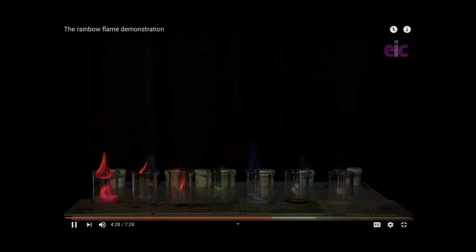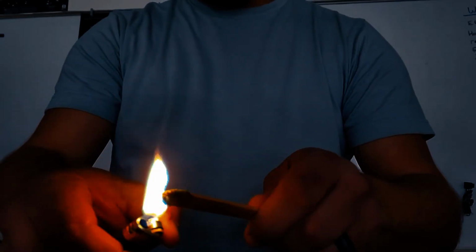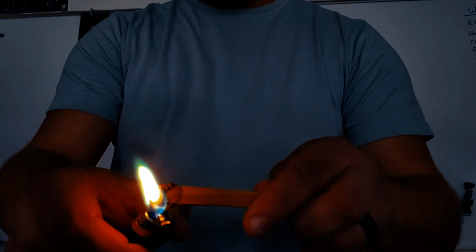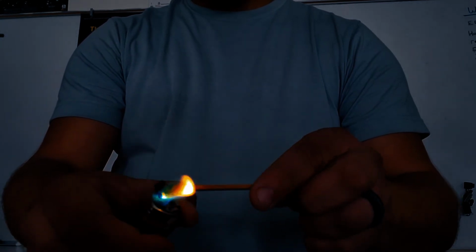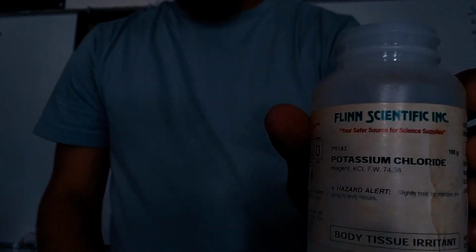So this relates because when we're looking at the periodic table of elements, sometimes it can seem, I think, kind of far removed from our real life. Here I'm trying to burn some copper. You can see the blue coming out there. And on the periodic table, we need most of these elements for basic survival.